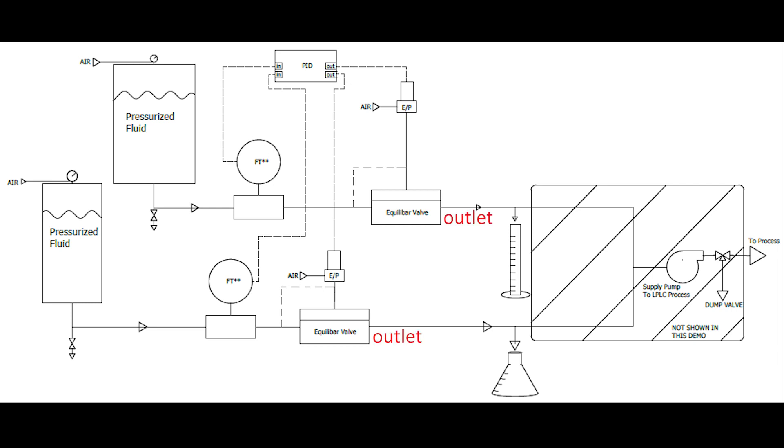In the demonstration that we'll show today, at the outlet of the two valves, the lines are open to the atmosphere and dispensing into two different graduated cylinders. In an actual process, this would feed either a supply pump to a low pressure liquid chromatography system or a dump valve that would be used for the settling time at the beginning of a buffer system production.